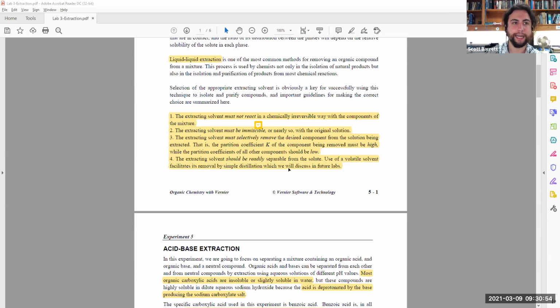And so what this means is that you want to perform your extraction and you pull what you want out. They want you to go forward with a good solvent that is able to be distilled off. So remember, in simple distillation, when we take our cyclohexane and distill it off, it boils off and then distills down. Well, what we're left with is our original crude mixture, right?